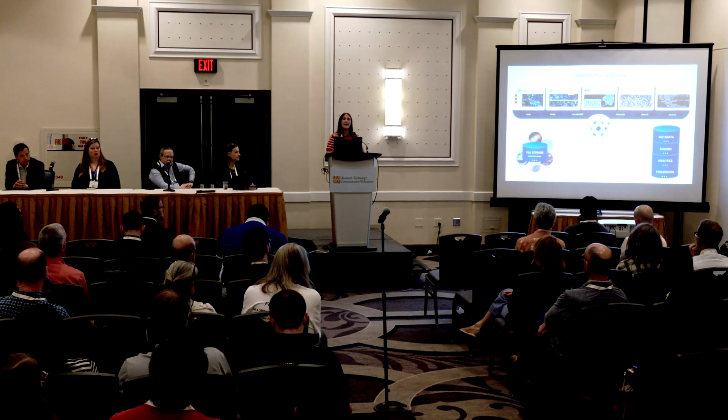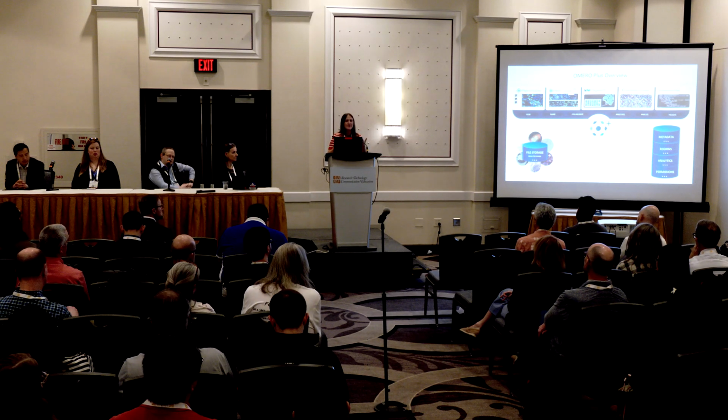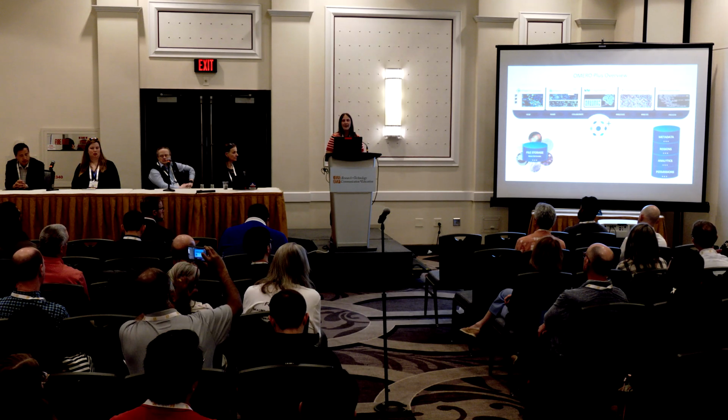And Omero Plus also has a database. The database doesn't store the images; they stay where they are. That's kind of the bulk of the data volume that you have. But things like metadata and regions of interest are things that are written into the Omero database. And then you, the end user, again, are interacting with the system over the internet via a browser. And so we have viewers like Path Viewer and other interfaces that are kind of tailor-made for exploring scientific data sets.